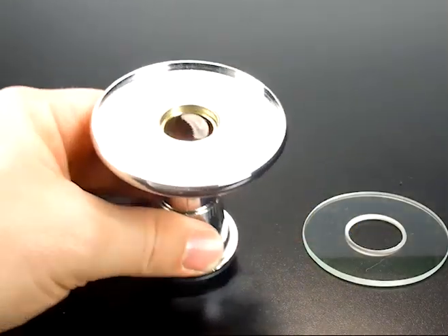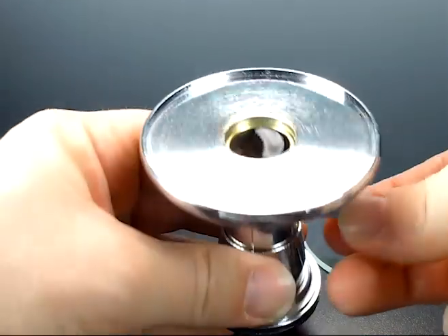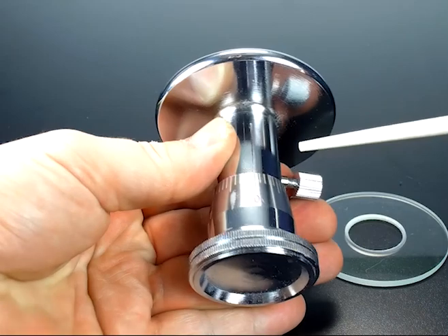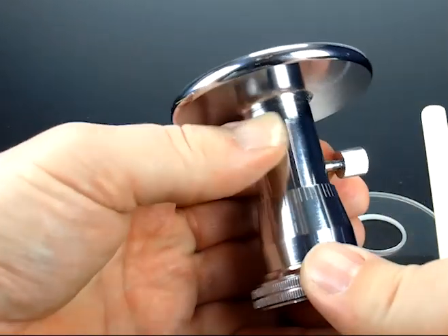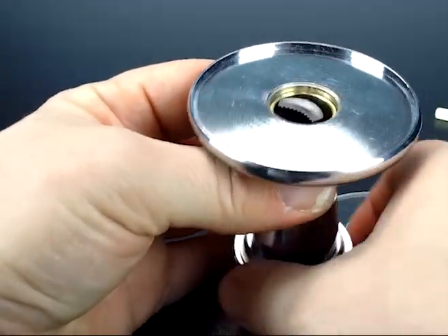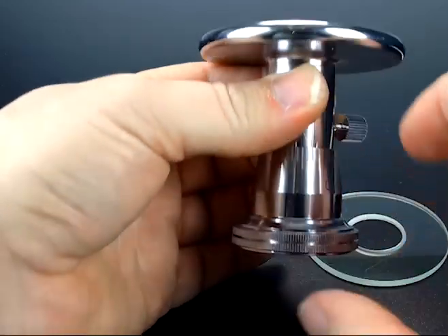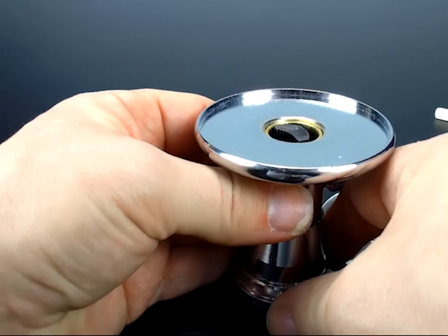The top of the apparatus is where you place your sample, and the knob on the side is how you can securely hold it in place. On the bottom you have a reference line and a scale, and every time you turn this around once, it is 500 microns that it lifts up.